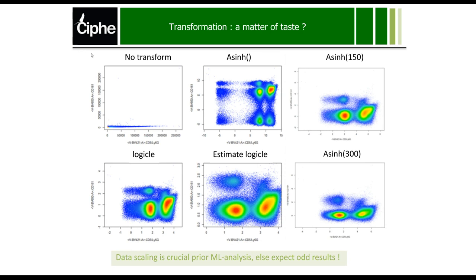Now, the other nice thing about Cytobank is the data scaling. It's very important, because if you don't set your scales around 0 correctly, you might have issues with dimensionality reduction techniques. For example, with arcsinh without any transformation, you see some cells that are very negative, some cells that appear dim, and some that appear high.